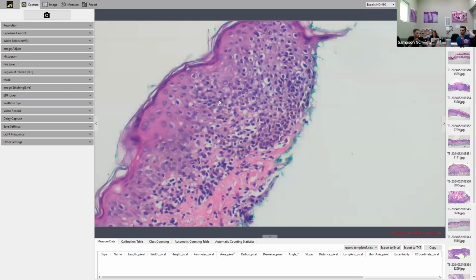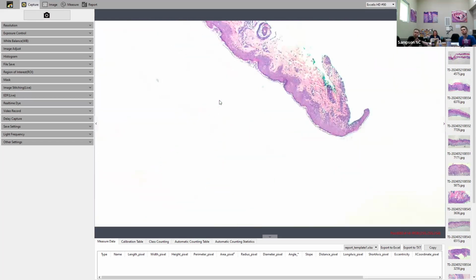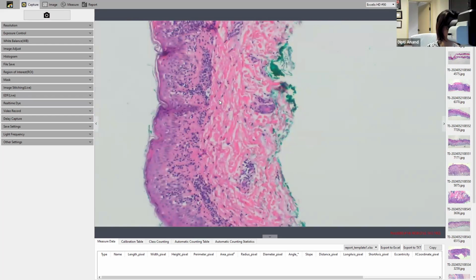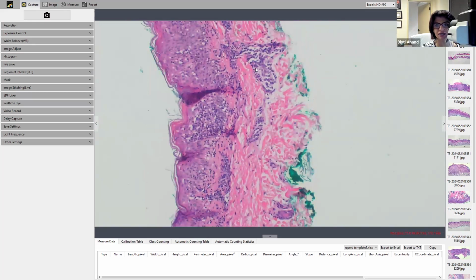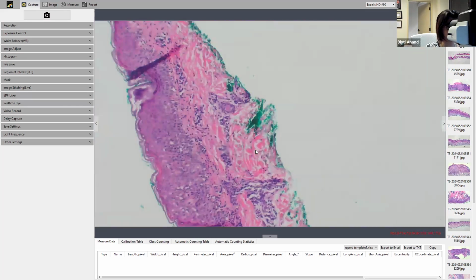You see that? Along with the other features that you will see from top to bottom. There is going to be crust formation. You can see here the parakeratosis. You can see the lymphocytes in the epidermis. You can see the necrotics. This is a shave biopsy, but there will be a perivascular lymphocytic infiltrate. You can see extravasated blood. So all of that will be pityriasis lichenoides.